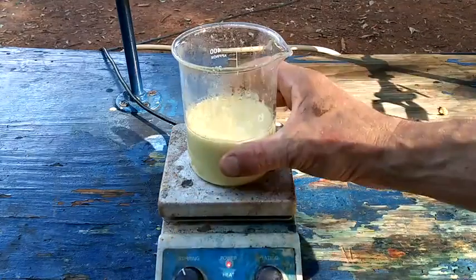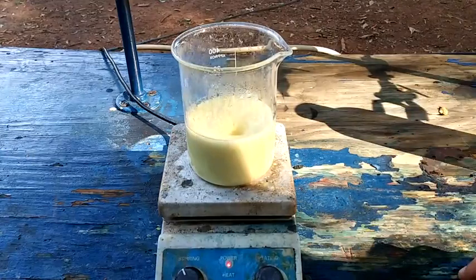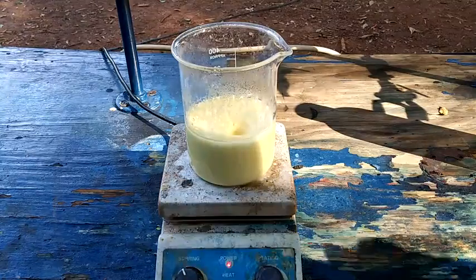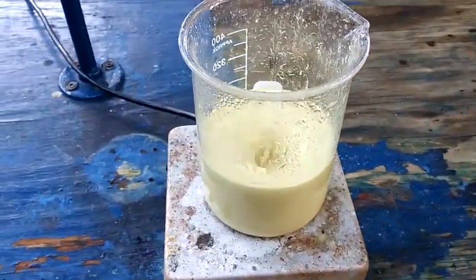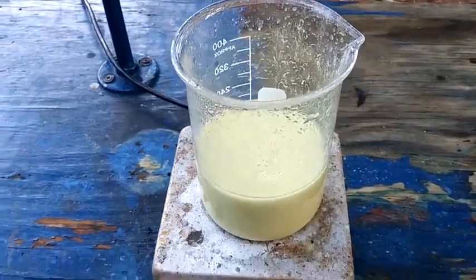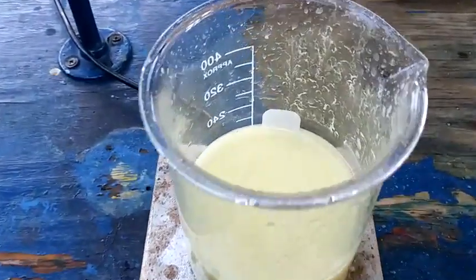Once the solution is alkaline, we just need it to stir for a little while and then filter off our bismuth oxide and we're done. Well, with this part of it anyway. Alright, I've had this stirring now for about 10 minutes, so I'm going to go ahead and turn that off, and then I'm going to get everything set up to filter off the bismuth oxide.